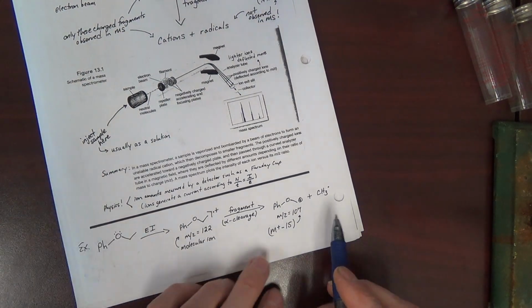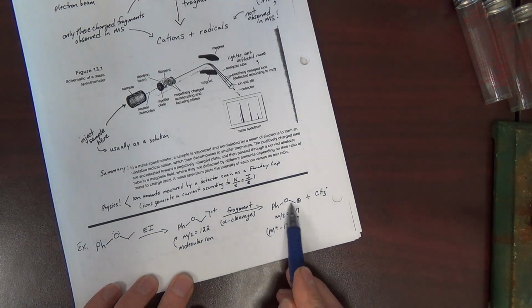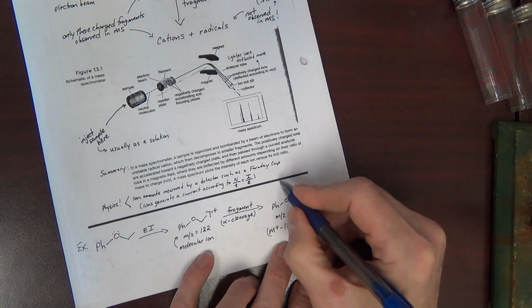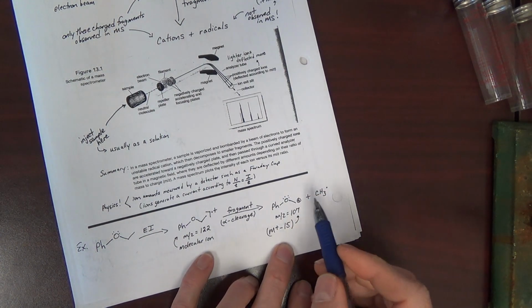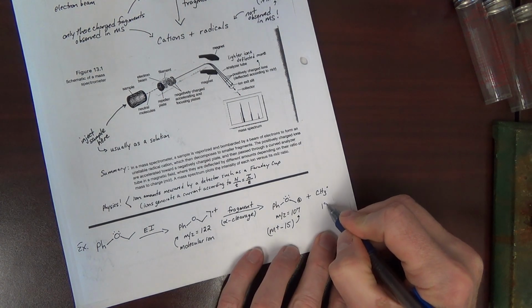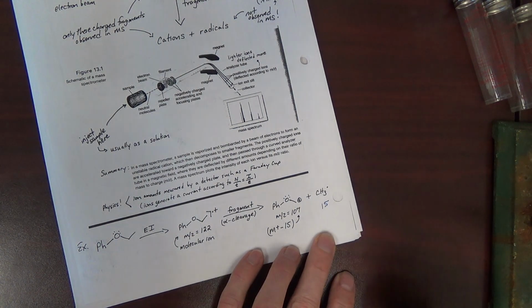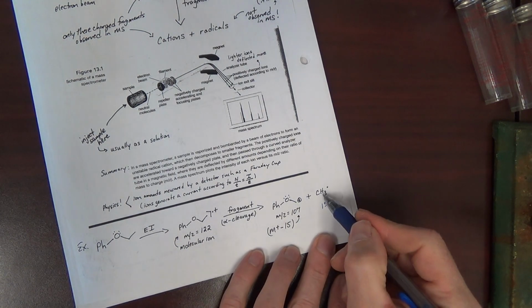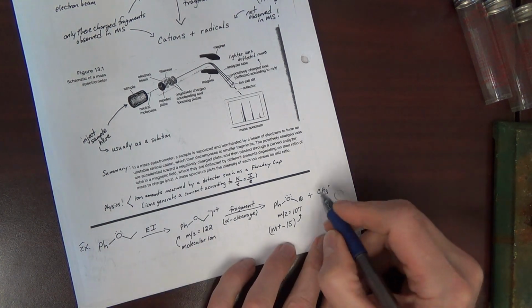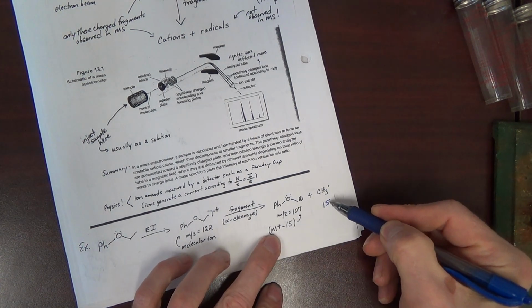And this is an example of cleavage. We can cleave off the methyl group, essentially here, and be left with the oxygen CH2. Positive charge on the CH2. We know we have lone pairs here. Okay, we have lost a methyl. That's a mass of 15. We need to learn common masses. A methyl is 15 and ethyl is 29. If we lose 15, 122 minus 15 equals 107. Very often we will say that this is M minus 15. We have lost the 15.